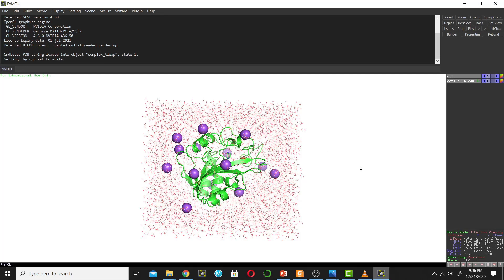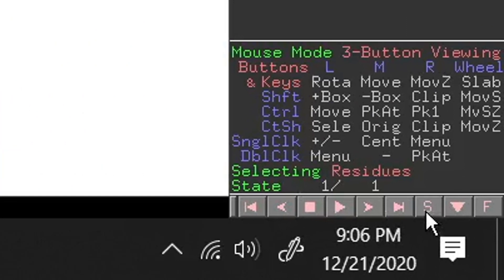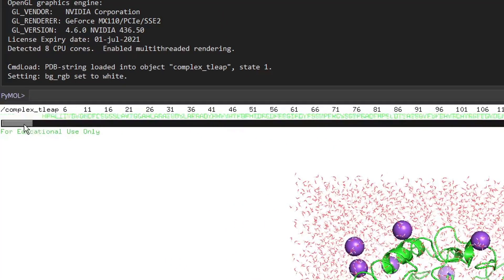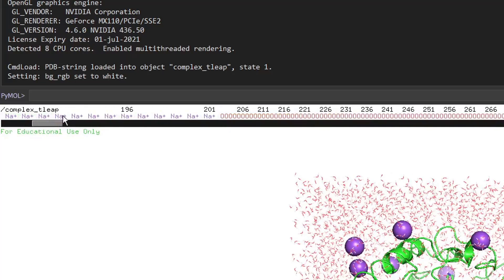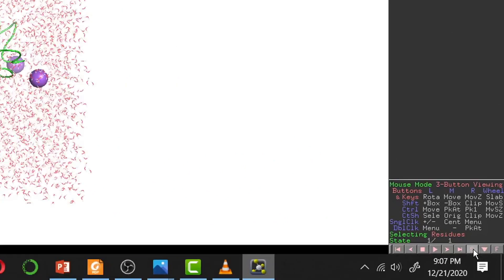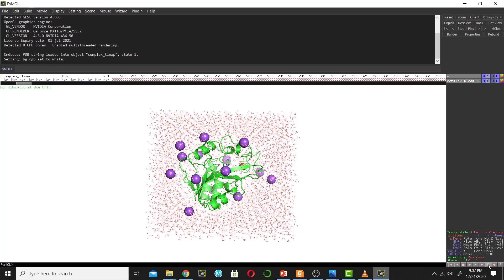Before removing anything, I will show you how to display the sequence of this protein. You can show the sequence by clicking the S button. The green color is the protein sequence, the other colors are sodium ions and red are water molecules. You can hide it again by clicking the S button to toggle the sequence on and off.